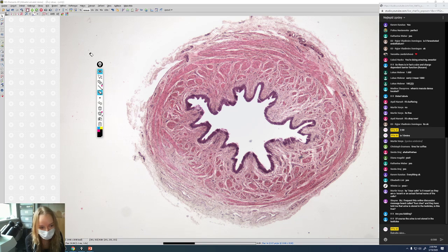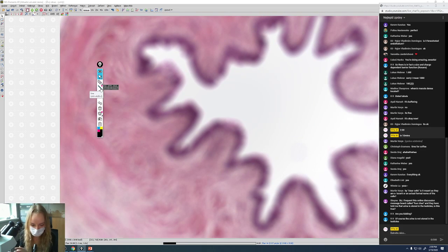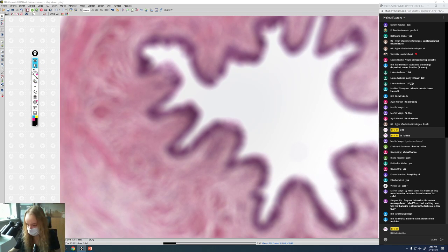And now we're going to look for the wall. So what are the main parts of the wall? Yeah, I'm going to put it like this.